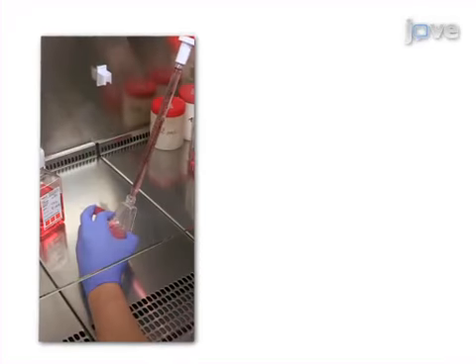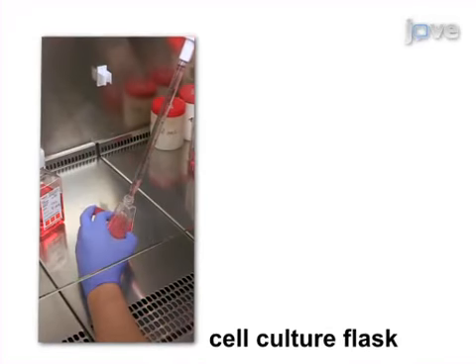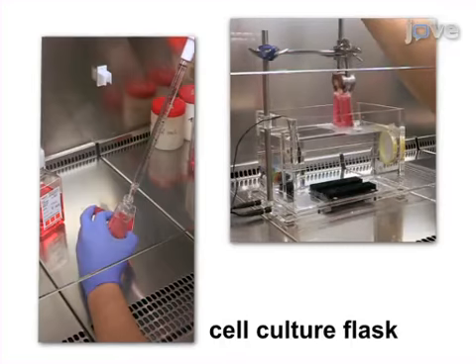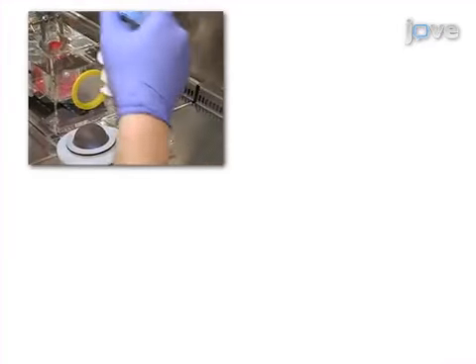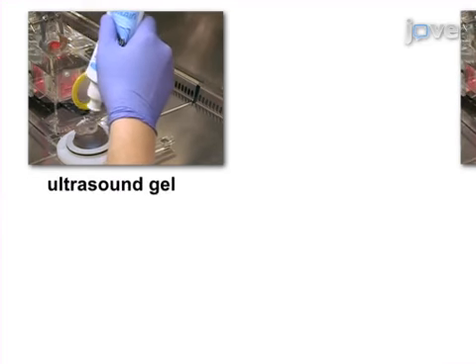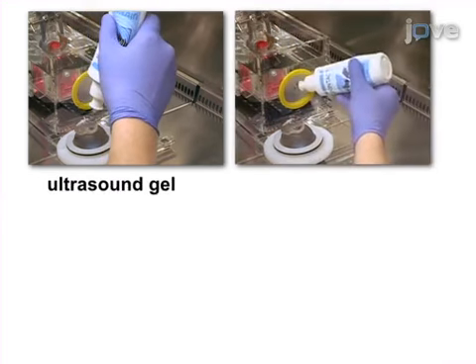This is accomplished by first filling a cell culture flask completely with culture medium and then placing the flask into a heated water bath. The second step is to use a generous amount of ultrasound gel when coupling the applicator to the water bath.